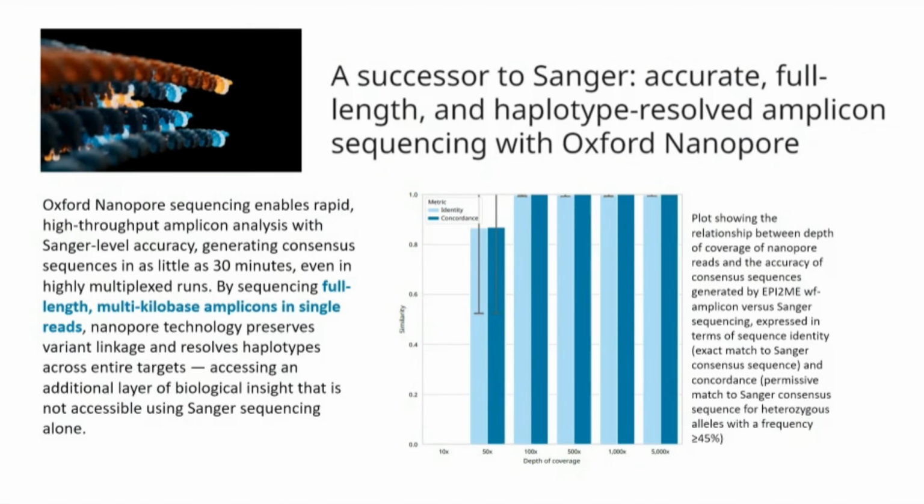If you have amplicons longer than 1000 base pairs, you normally hit the limitation of Sanger sequencing. In that case, Oxford Nanopore sequencing helps us resolve amplicon sequences much longer than 1 kb. It can sequence multiple kb of amplicons, and with the read length it can also help us do phasing or haplotyping, even though our workflow does not expect diploid samples.